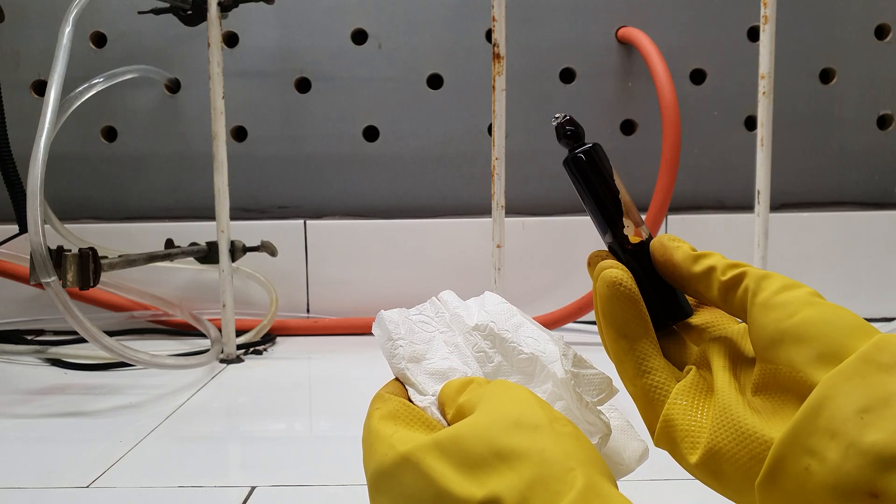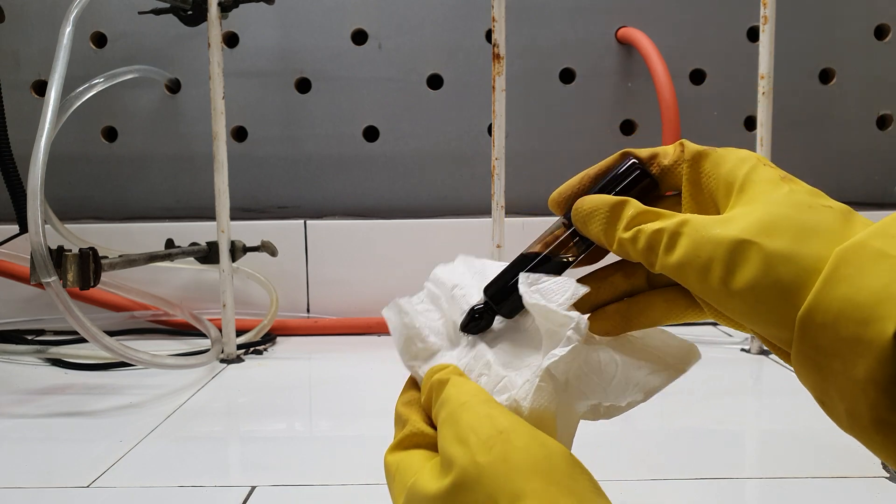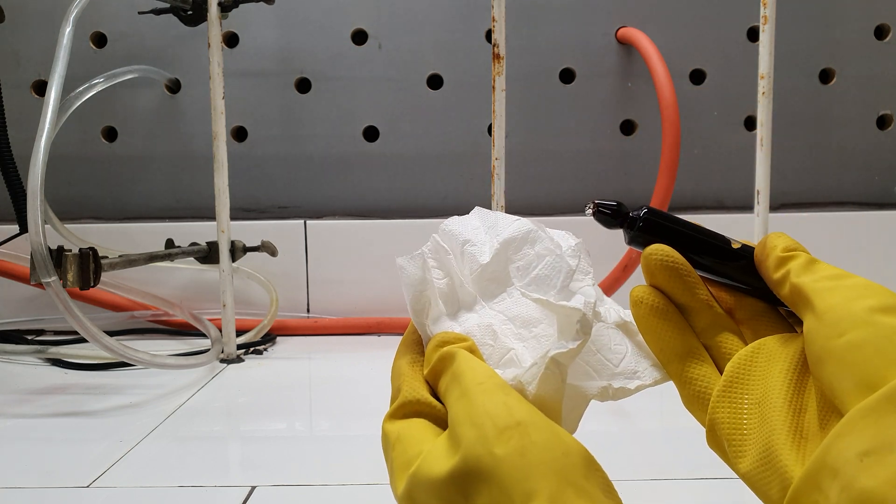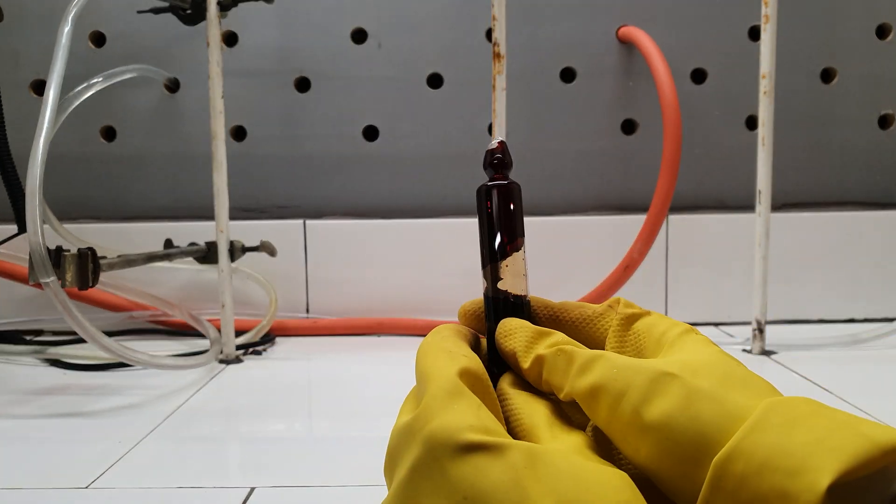A simple test to check if the ampule is sealed correctly is to invert it and rub its edge on a paper towel. If there is any leak, it will leave a mark on the paper. Mine didn't, so it must have been sealed correctly.